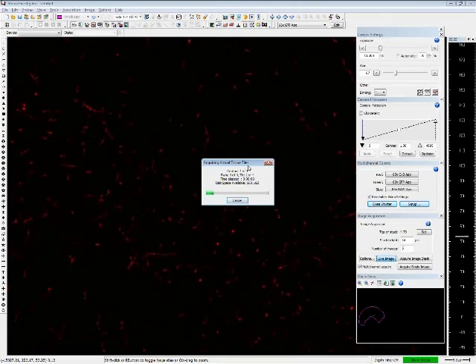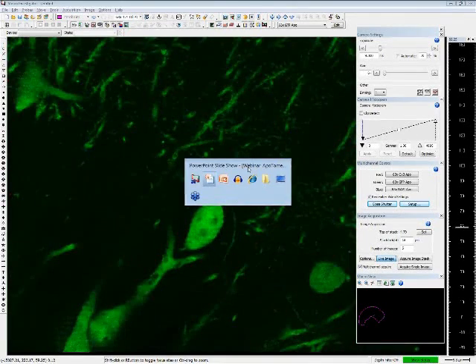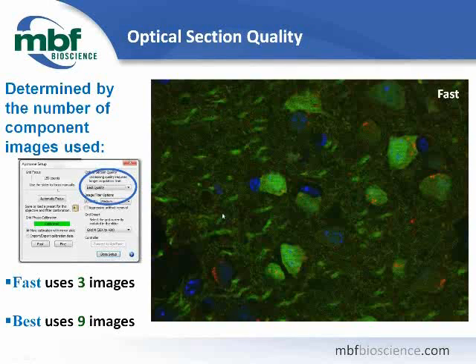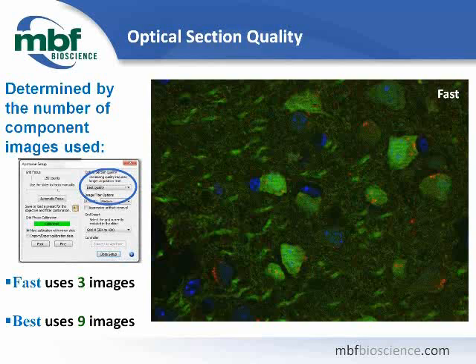While we wait for this to finish capturing, let's continue our discussion. Someone asked about applying this technique to wide-field images captured previously — for this strategy to work, the grid pattern needs to be projected into the focal plane during acquisition time, so you do need to do this live. I'd like to talk about optional settings available in the Apatome dialog. The first is Optical Section Quality, which has four settings from Fast Acquire to Best Quality.